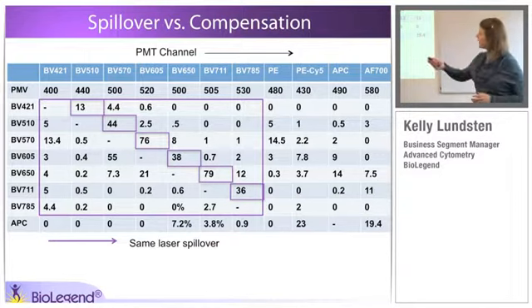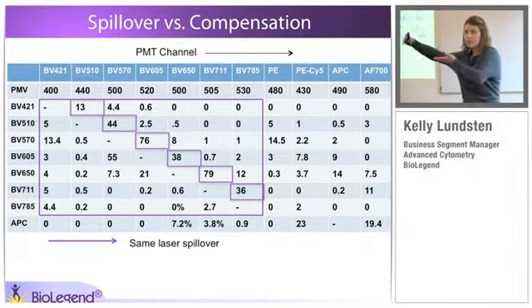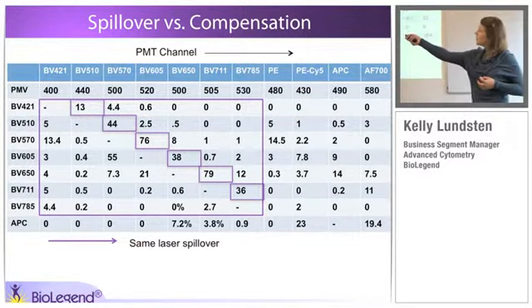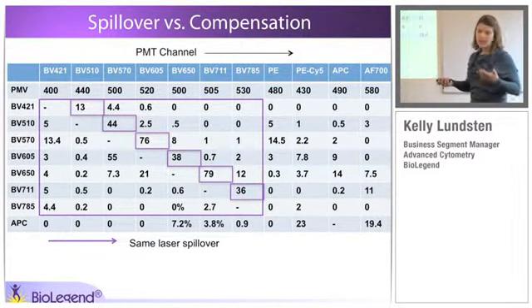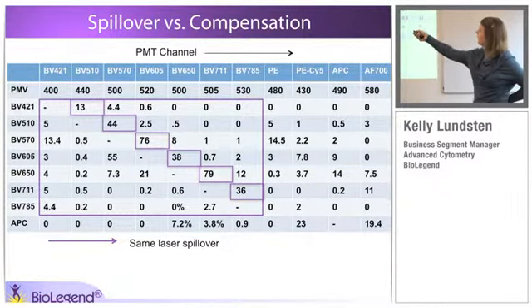So you're going to have particular fluorophores, like all the brilliant violet fluorophores, where they're going to have a certain amount of spillover into each neighbor's channel from the red direction. You can see that the voltages are not particularly widely spread. Your BV421 channel will always have a very low voltage. It's also because it's an extremely bright fluorophore. However, the disparity here is not tremendous. So some of these can be relatively high, BV650 into BV711, for example, BV510 into BV570.